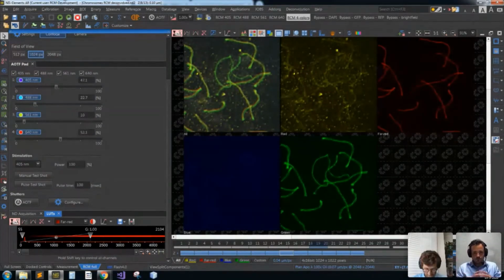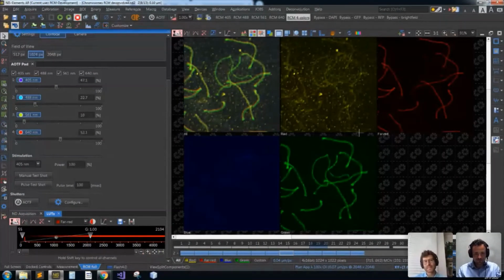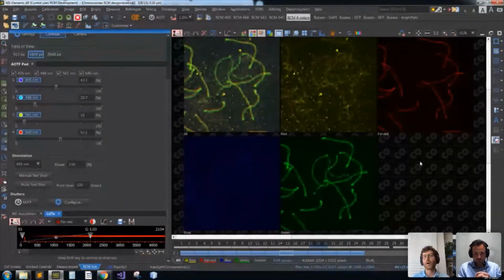And then the last question I had was from Boju. Can we get more than square root of 2 resolution enhancement? And sadly, no. It would be beautiful, but sadly, no. We are actually limited by the motion blur, because we need to scan faster. The Re-scanners have a bigger amplitude, but the same frequency as a scanner, so basically they go faster. Because they go faster, it introduces some motion blur. And so taking that into account, as well as the resolution enhancement, it's maximized.